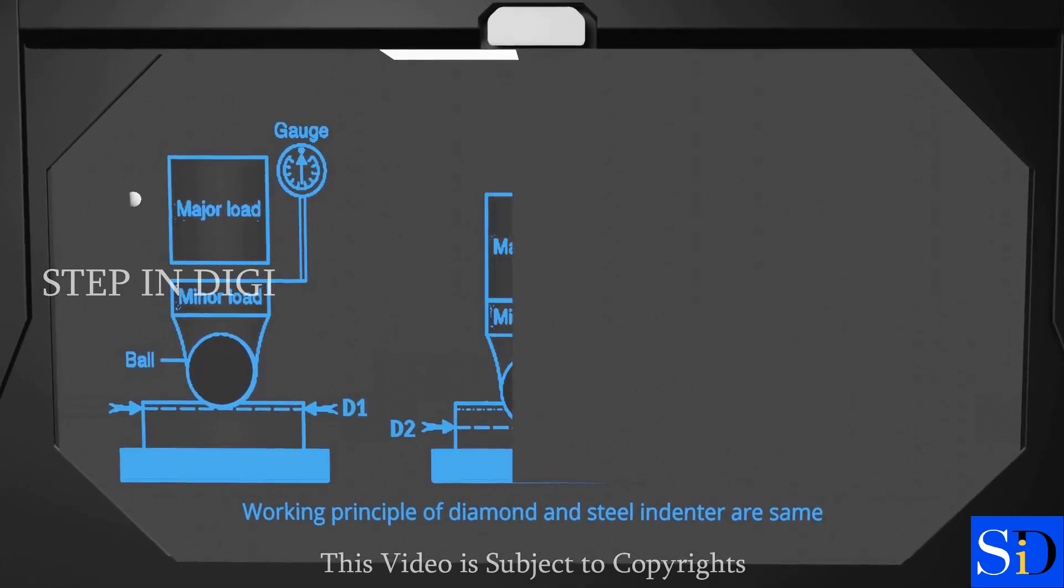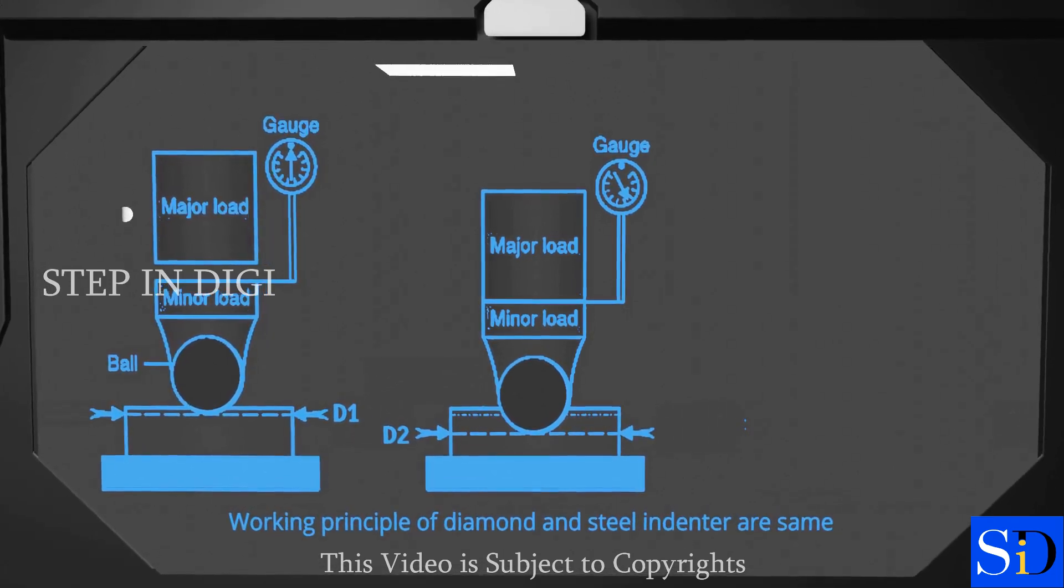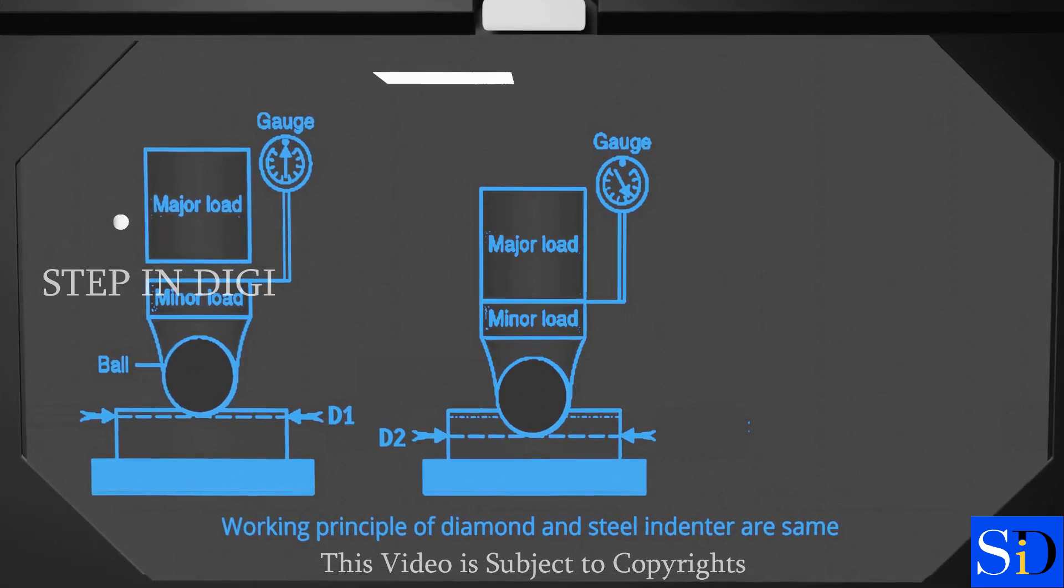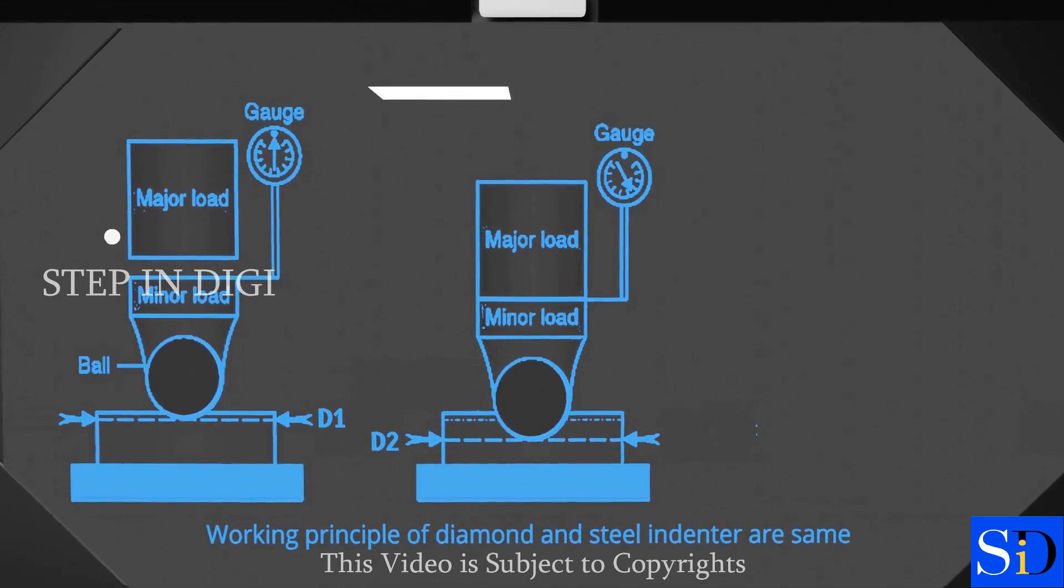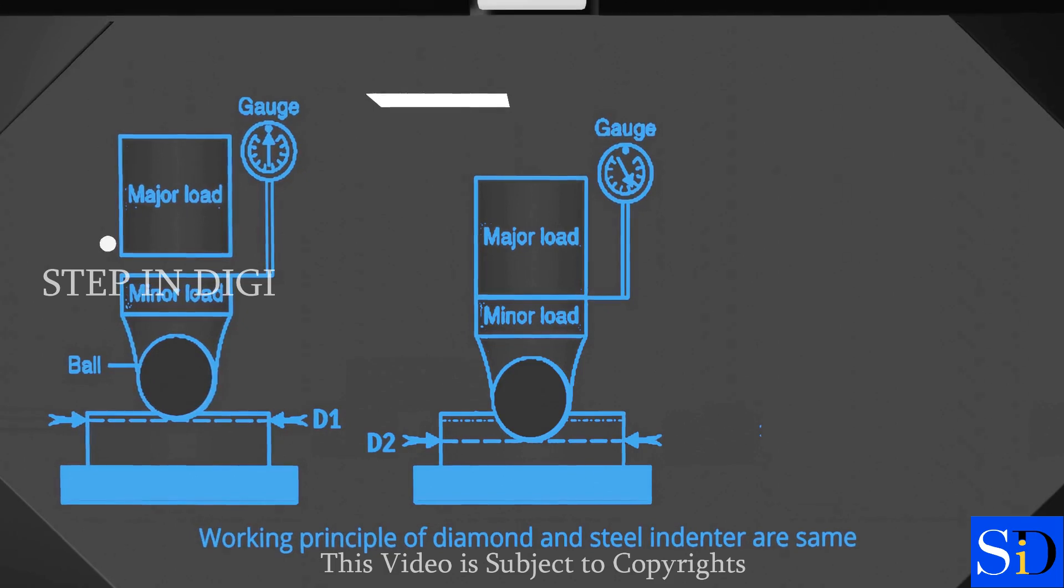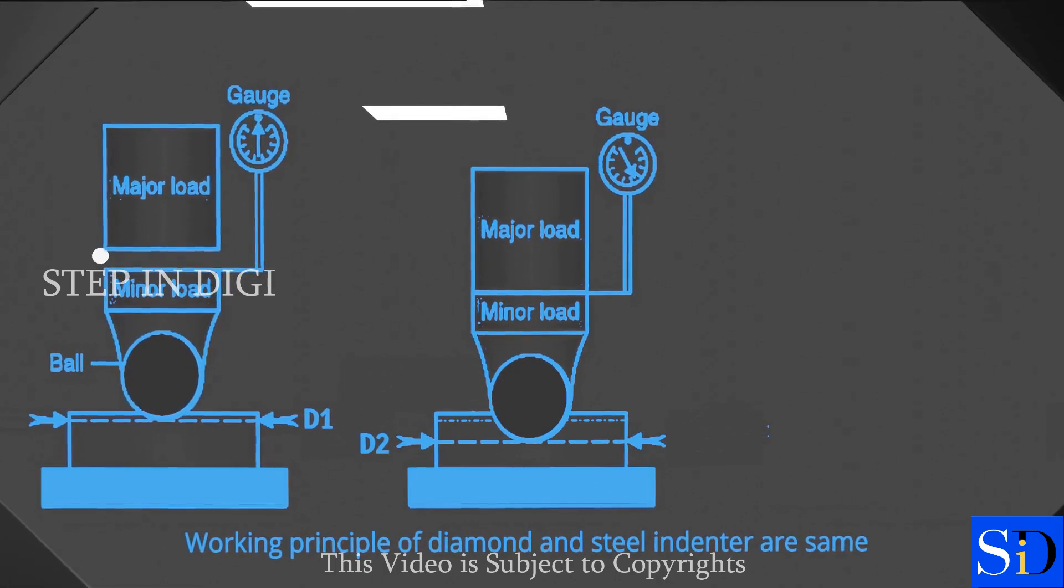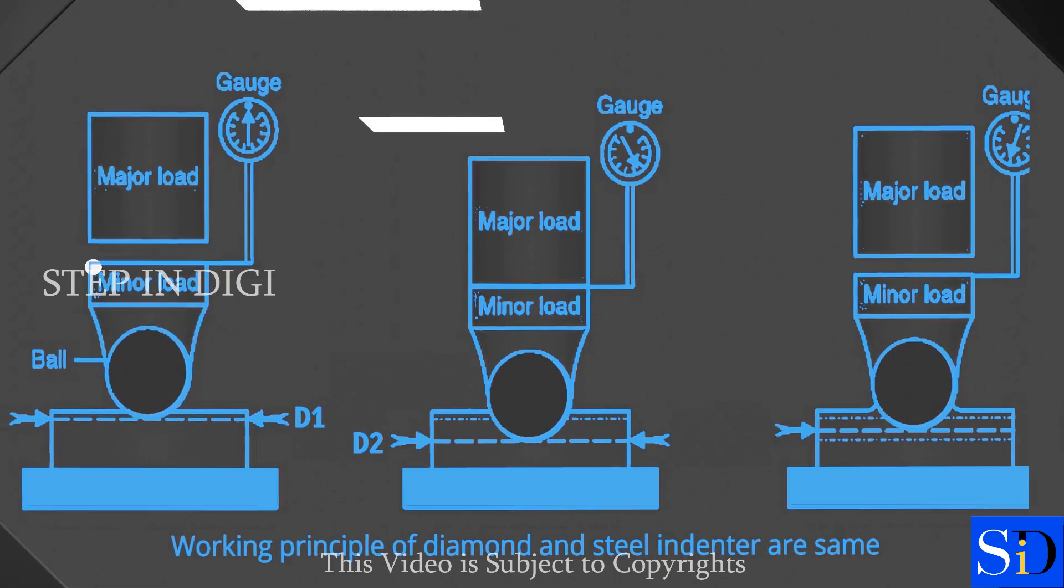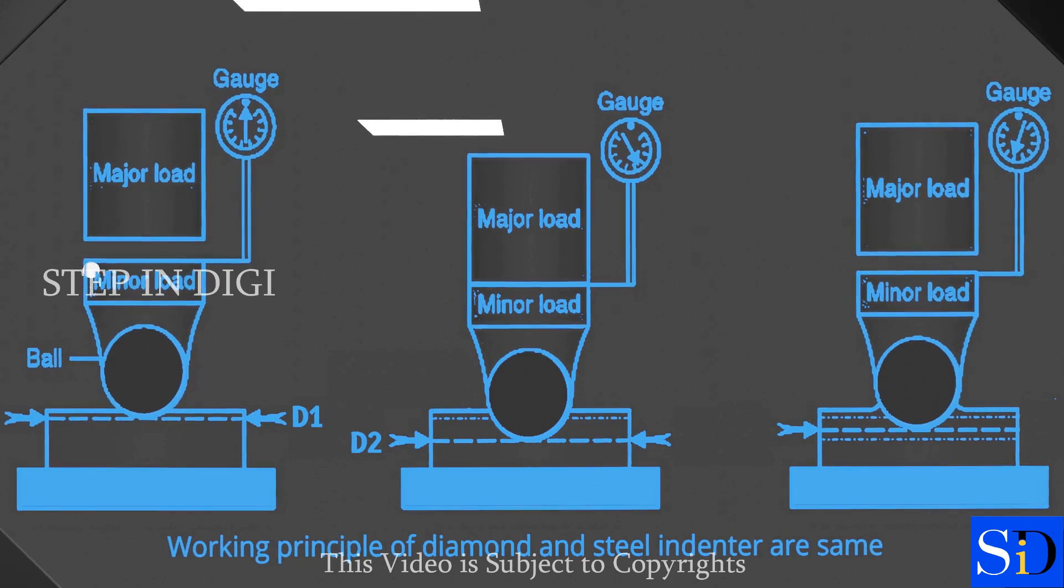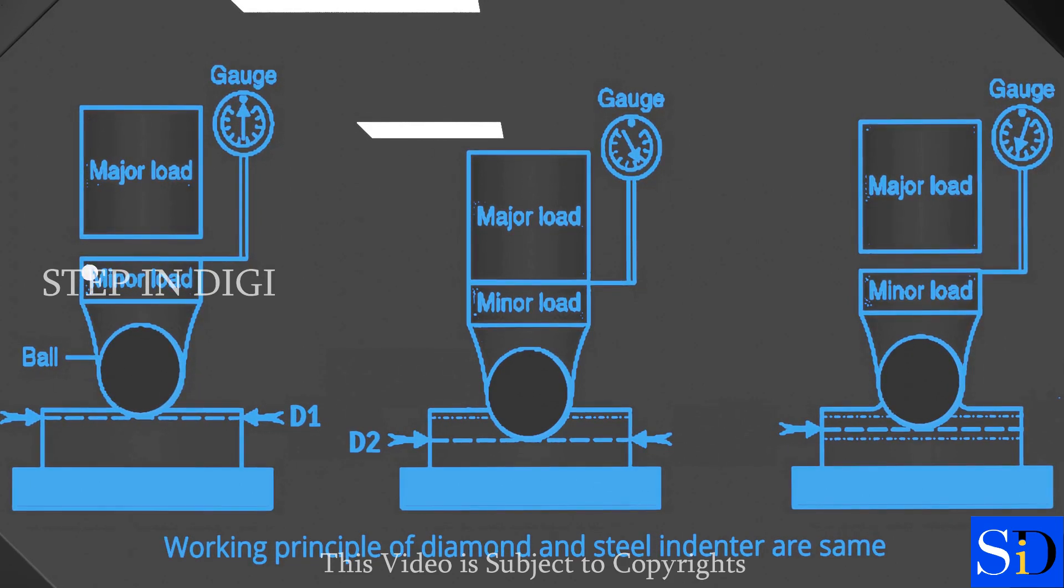With minor load still operating, major load is added according to the scale mentioned in the machine. The application of major load increases the depth of penetration. Some materials show considerable time-dependent plasticity. The duration of application of major load shall be neither less than 10 seconds nor greater than 15 seconds. Then the major load is removed with the minor load still acting. This operation results in the partial recovery in the depth of indentation.